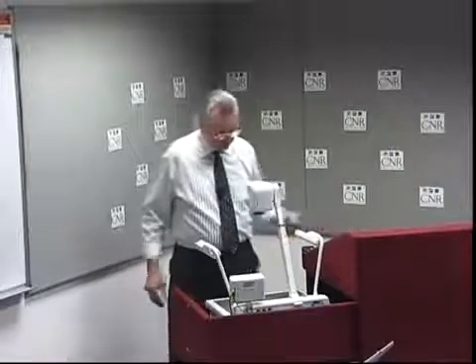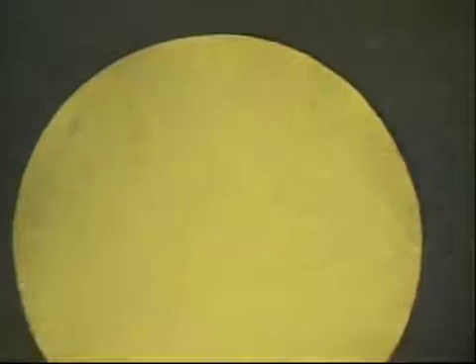I will show you now another technique. This is a hand sheet of OCC. It looks brown, as it should. It's liner board. It's old recovered cartons, old cartons. They come from grocery stores, from Best Buy, from the department stores. I think maybe even some of it is curbside. But in any case, the OCC contains stickies.